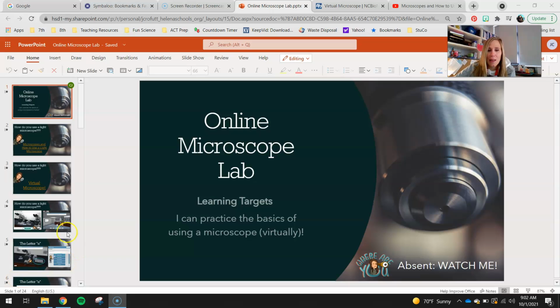Today's episode is all about online microscopes. So we're going to be working with a virtual microscope to figure out basically how to use a microscope and how to see things that we're not able to see with our human eye.